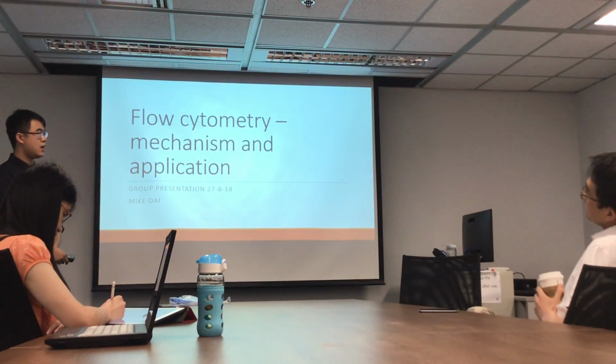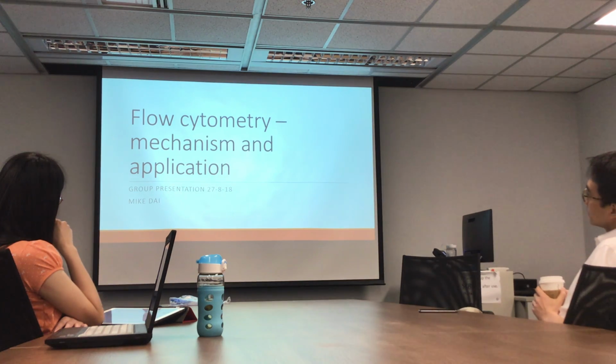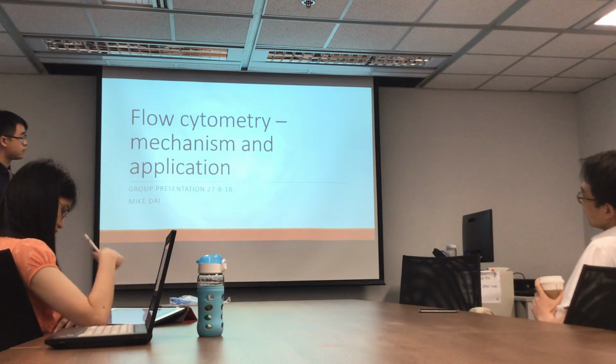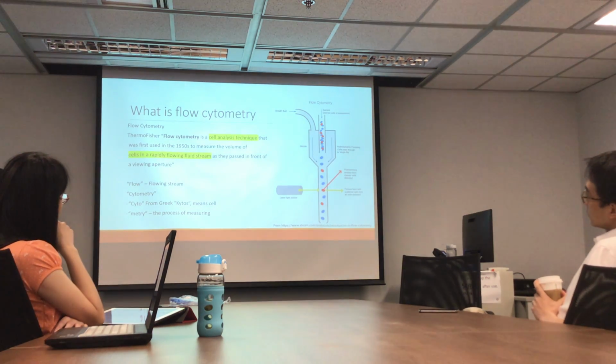Biological experiments, and it has many usages and applications in a diverse range of areas, which also includes the research project that we're doing right now in our lab, which I'll talk about later. So let's start off with an introduction of what flow cytometry is.